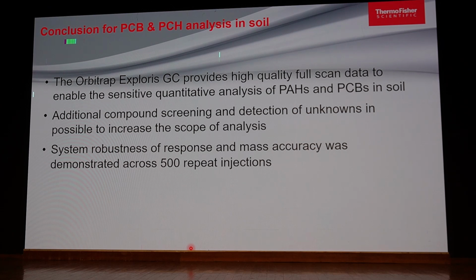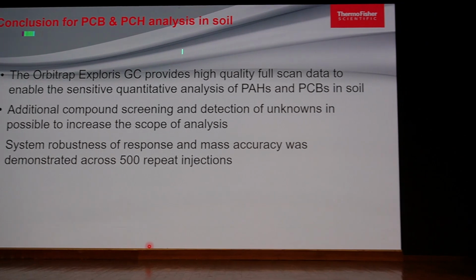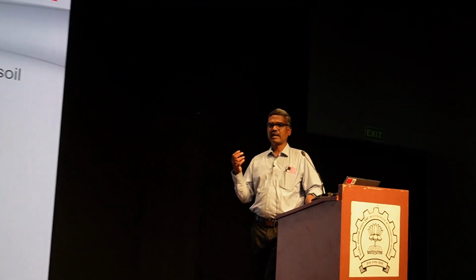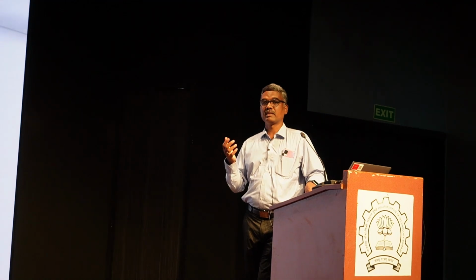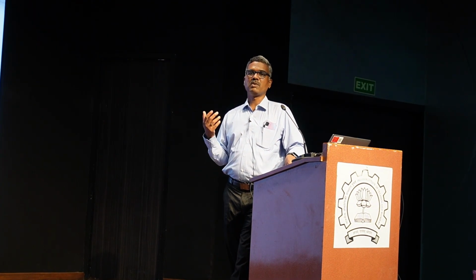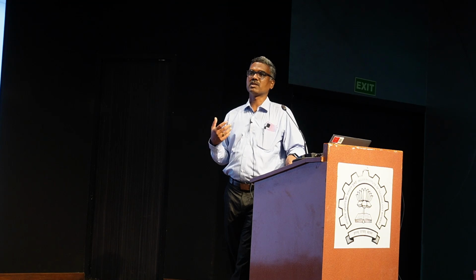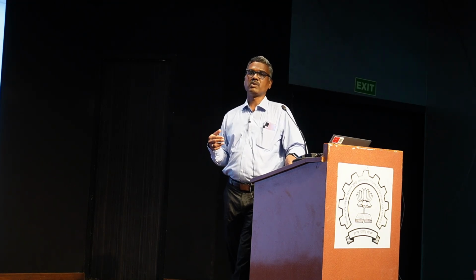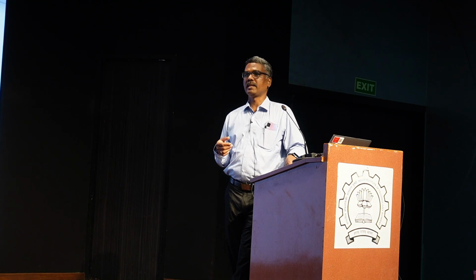Similarly, there are also new contaminants that came into the picture, basically PFAS. PFAS is also one emerging topic for the POPs, and they are analyzed by GC-Orbitrap as well as LC-Orbitrap or LC-MS triple quad also. So as per your convenience, whichever machine you have, based upon that you can decide. But for PFAS analysis also, you need to have a separate sample preparation area.